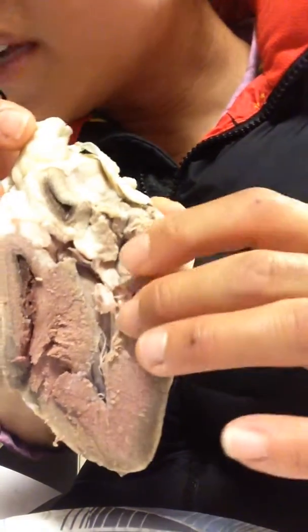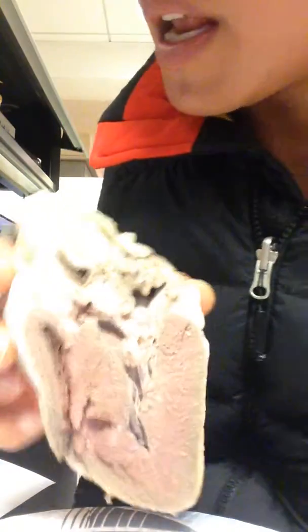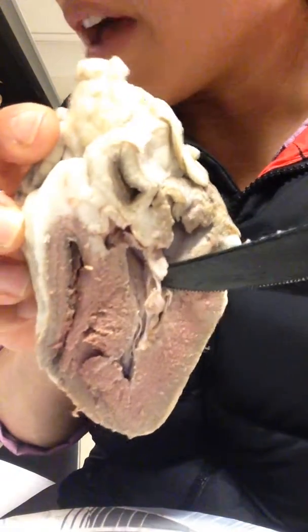On the next one, these ones are a little hard for me to figure out what is what, but let's try it. So there is the mitral valve. The mitral valve is, I think, on here. And then there's the aortic valve, which is below that.